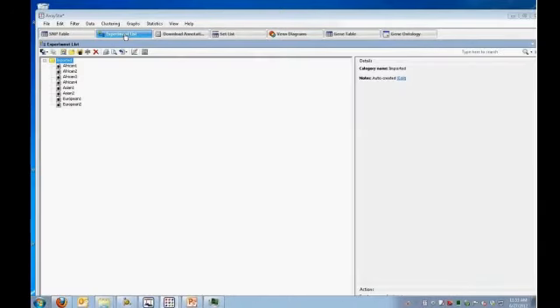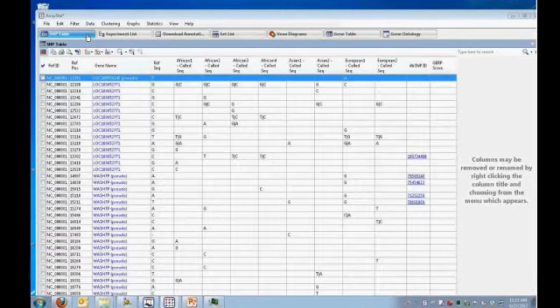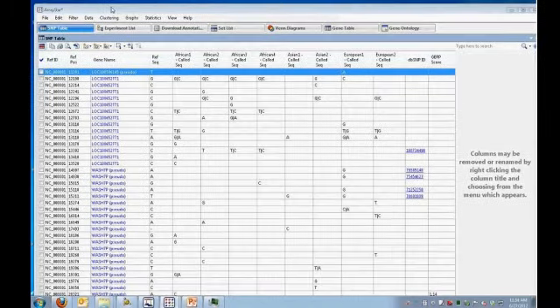And so here's our 8-exome project. You can see that ArrayStar automatically will recognize the 8 conditions. And so we have this list of experiments, and we get a SNP table. And the SNP table now is, even though it still is big, it is actually a summary of the SeqMan SNP table.